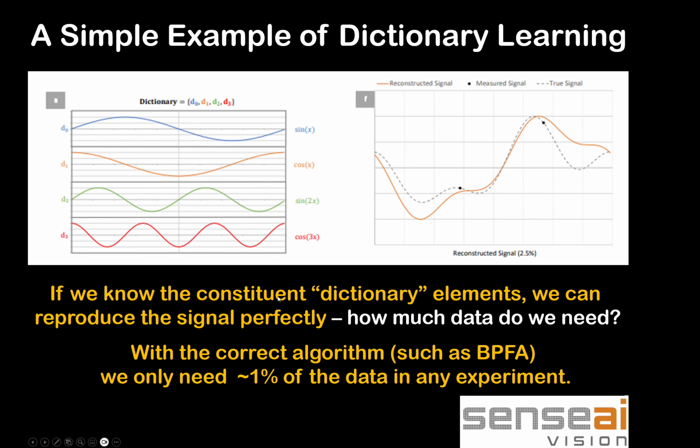Now, the difference in terms of the experiment we're doing in a microscope is that because we're subsampling, we don't know what this signal is. And because we're subsampling and we're not putting any learned information into the reconstruction, we're only getting it from the image, then we don't know what these components are.